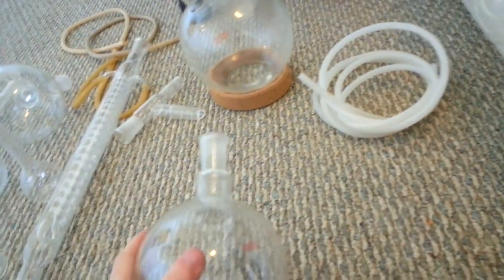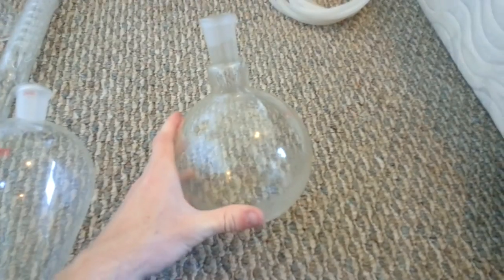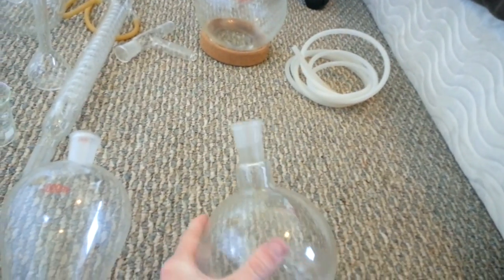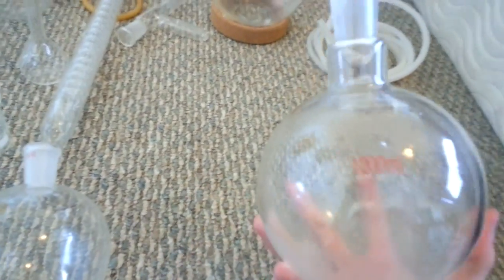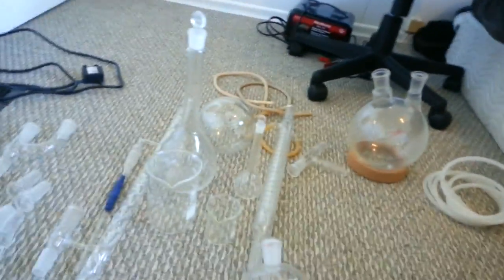Get some round bottom flasks — really useful things; you kind of have to get them. They're for reacting stuff and putting them in your heating mantle to heat up. You can have the option of one neck, two necks, or three necks. Honestly, if you're going to do anything, I would get a three-necked flask because it's no problem to take one of these little stopper things and stop off any holes you aren't using. It's better to have more than less. This one is 1000 milliliters, which I find is pretty good for most applications. I also have a 2000 milliliter one with two necks, which is also pretty useful.